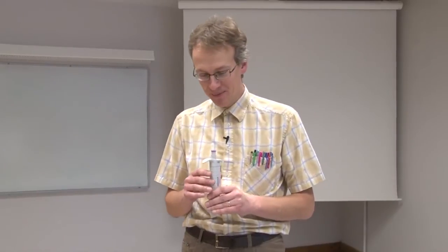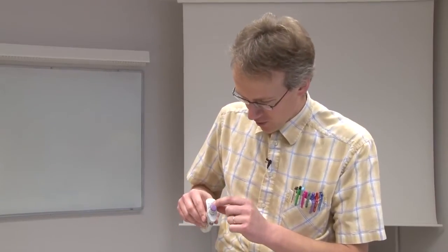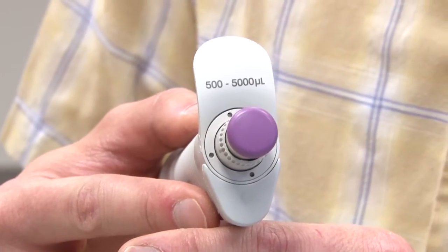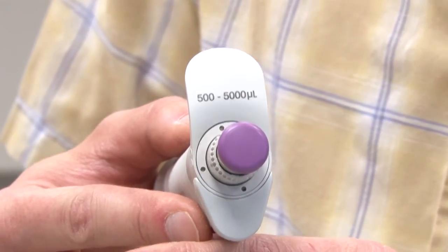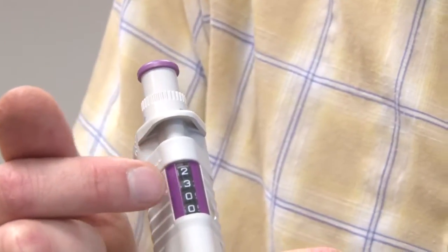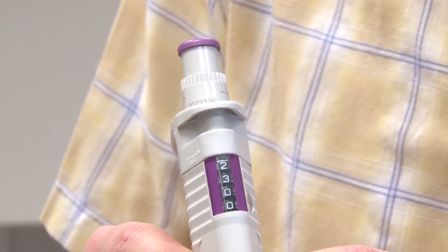Let us first examine this pipette. It is a pipette with adjustable volume and the volume can be adjusted from 500 to 5000 microliters, meaning from 0.5 to 5 milliliters. With this knob I can set the volume, and I have now exactly set 2.3 milliliters, which is what I need to pipette.